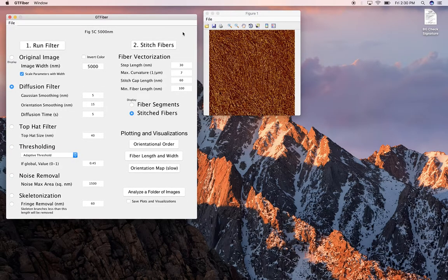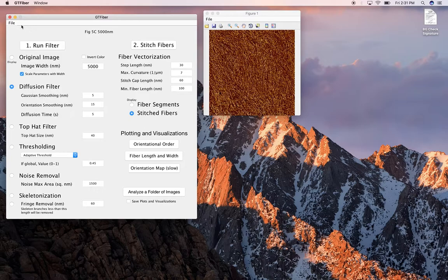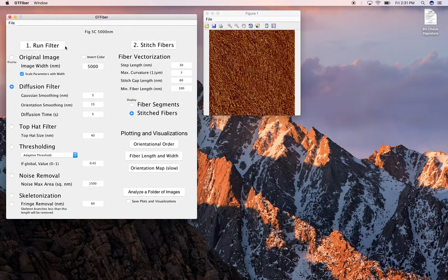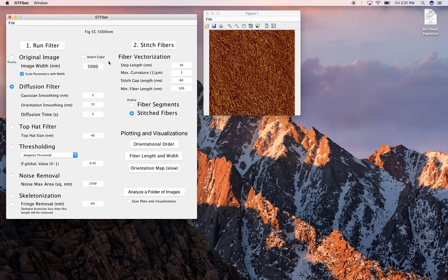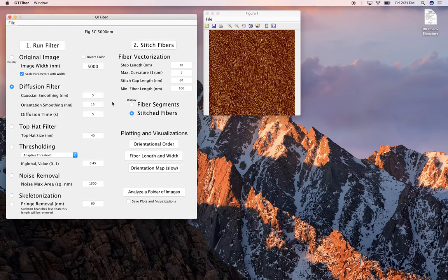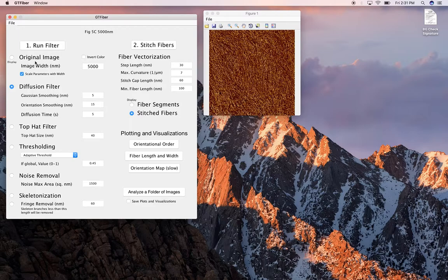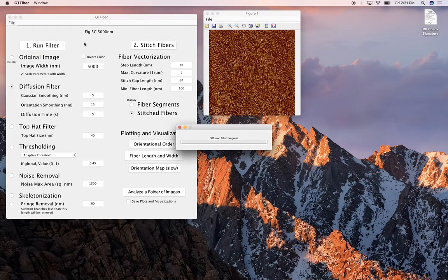So the first thing that should happen if it's successful is it opens up a window that shows your original image, and this is what it looks like. There's not a lot to do really except click these two buttons, to be honest. These parameters are defaults that I set through training this on my particular material system. These are P3HT nanofibers, and so if I click run filter, I'll just show you what happens.